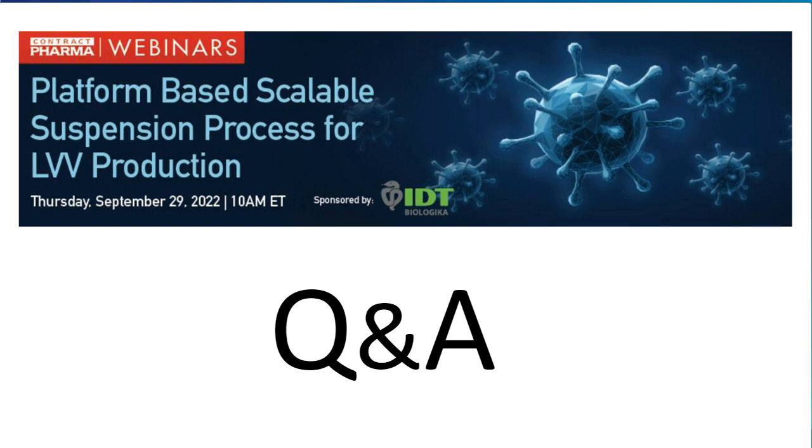So yes, they are useful, especially when you're using adherent cells. Our platform relies on a suspension-based system, so we wouldn't use that, but there are labs which produce lentiviruses using iCELLis bioreactors. Some of the factors that go into deciding whether you can use such a system are, firstly, what kind of scales you are targeting and whether your adherent cell system is able to get you that. And if the answer is yes, and you're using, let's say, a HEK293 type cell system, then you can use a fixed bed bioreactor.